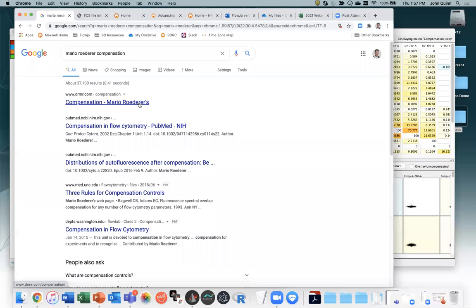I think a deep dive on a handful of these publications is probably the best way to achieve expert status. And the most important advice that I could give is to think through what you're trying to achieve, that it's a control for the fluorochromes, and then set up your experiment so that it's easy.